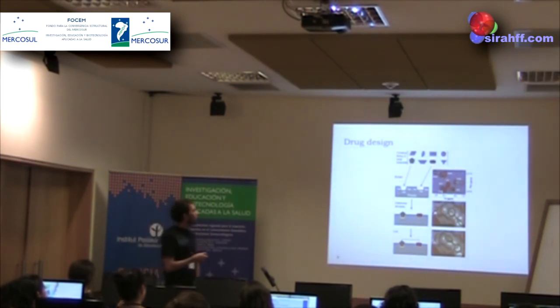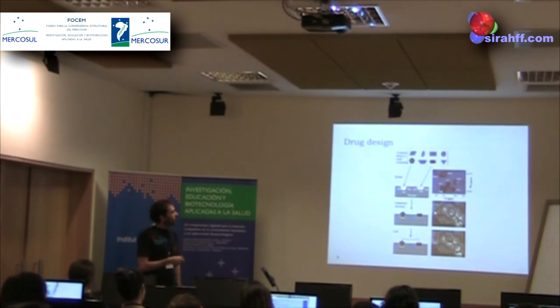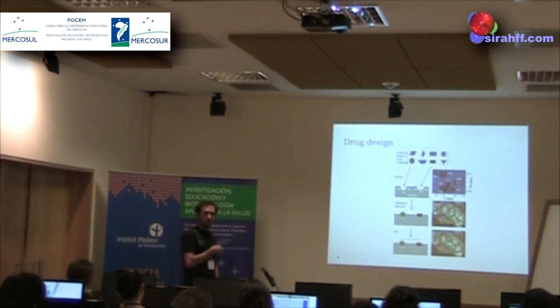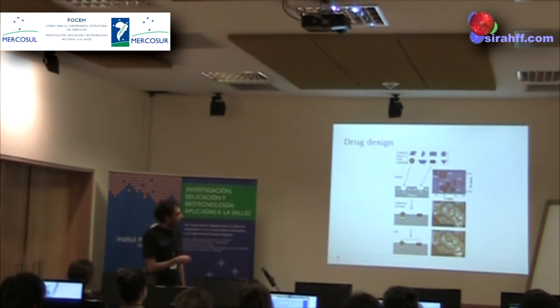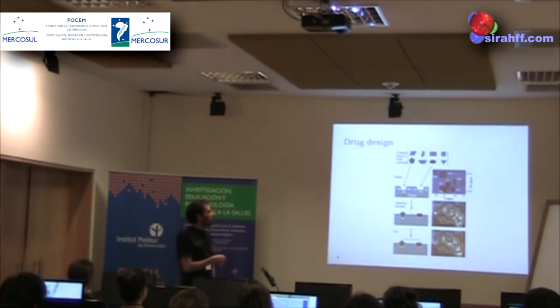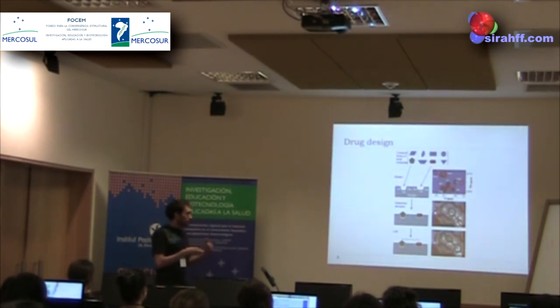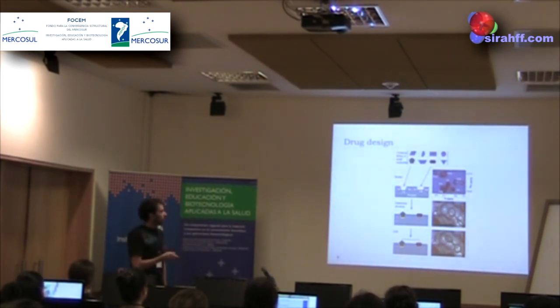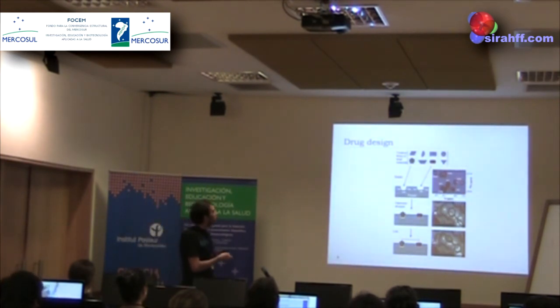It's widely used in drug design because you can see not only the protein or the target that you want to work on, but you can also see the ligands and determine whether, for instance, the ligands are close together when bound to an active site or not, and in this way act rationally through your compound or your lead.